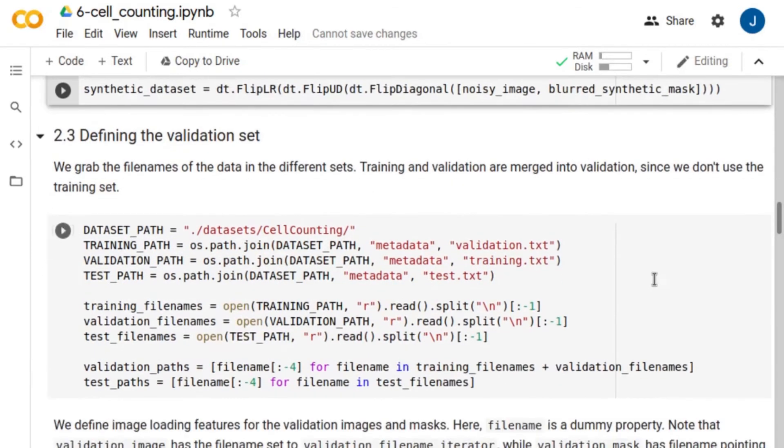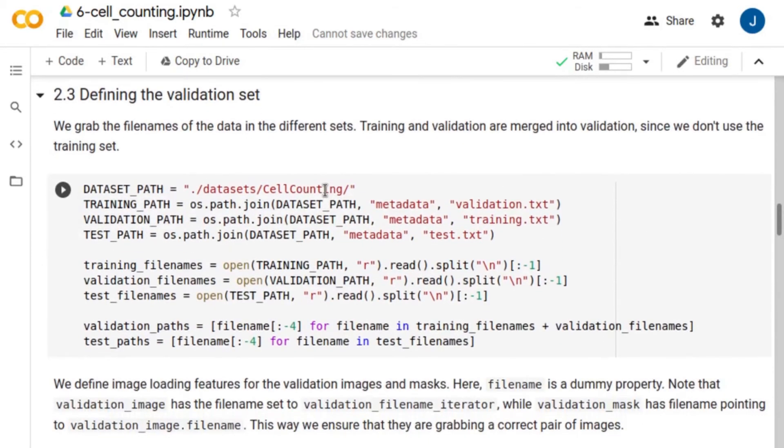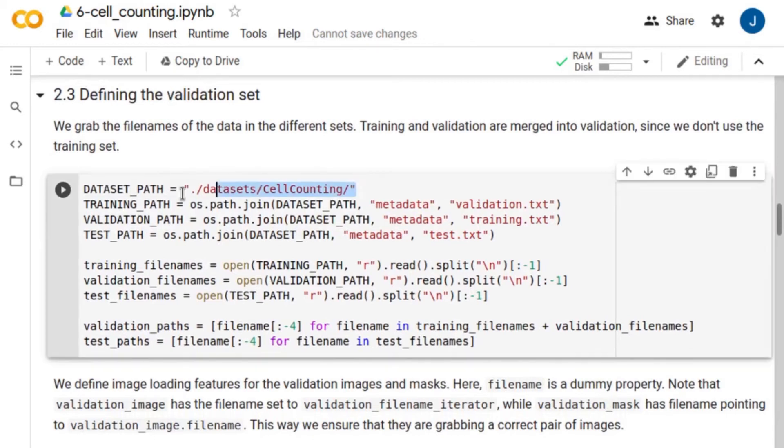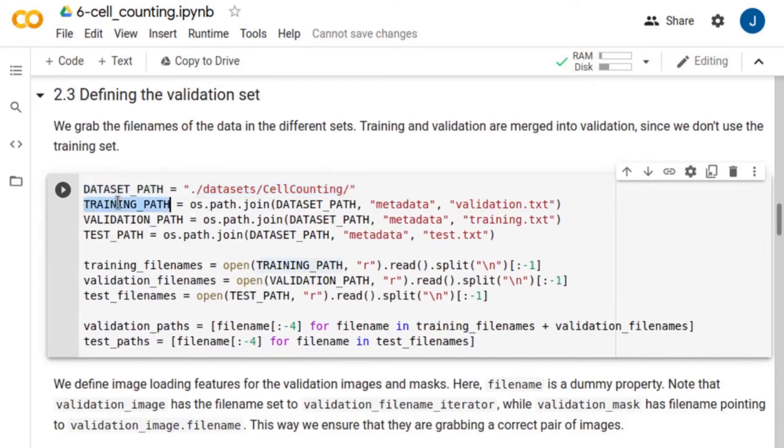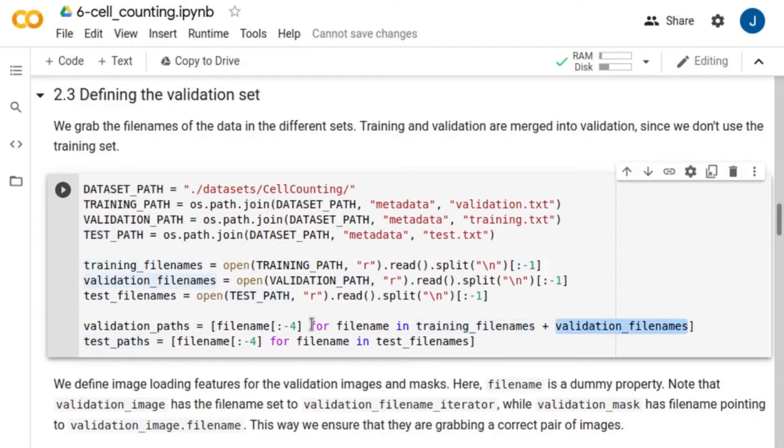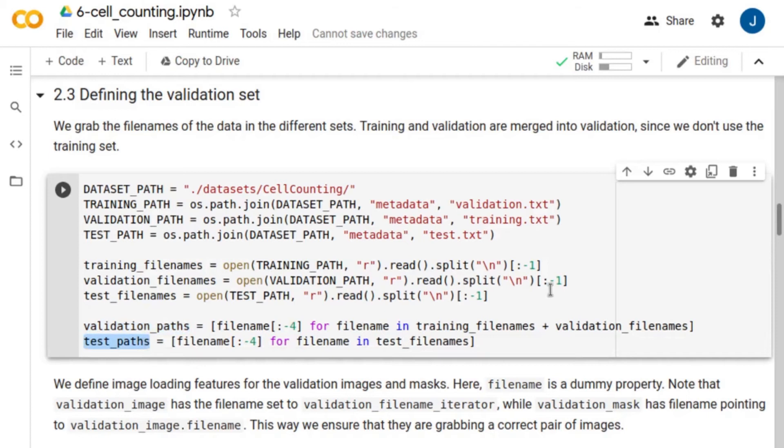Now, we define the validation set. We will test the network on experimental data. First, let's define the path to the experimental database. Originally, this dataset is divided into training, validation, and test images. Since we are training the network using synthetic data, we merge training and validation images into a single validation set that we will use to monitor the performance of the network during training.